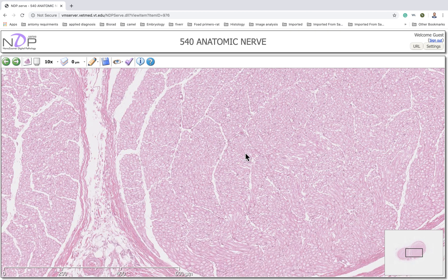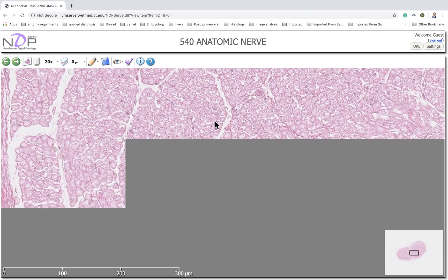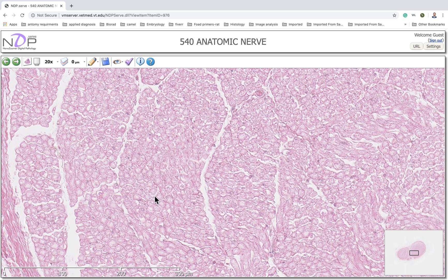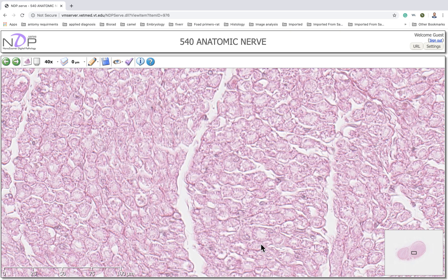If we increase the magnification further, we can start to see these axons. Most of these axons contain a myelin sheath, which means they are myelinated axons. The appearance is similar to a donut or a tire. We can see this structure here — all of these are indicative of the myelin sheath, with the axons inside.